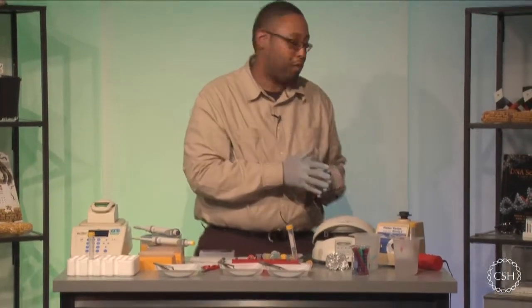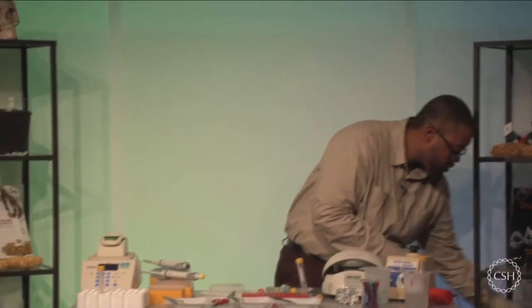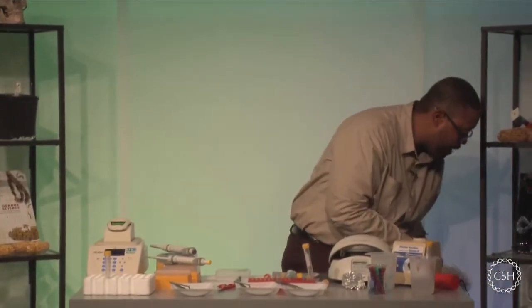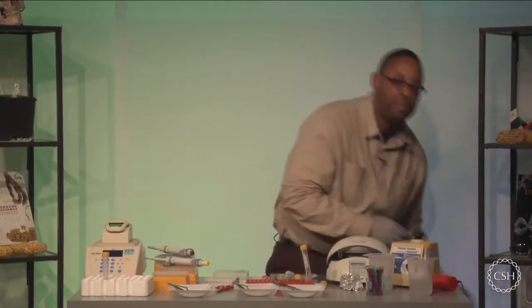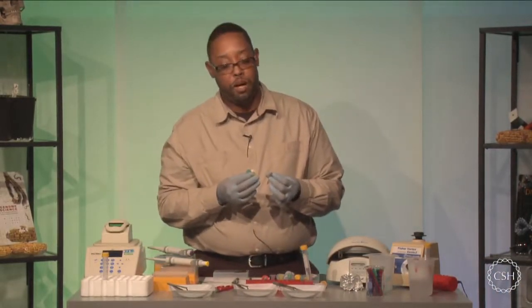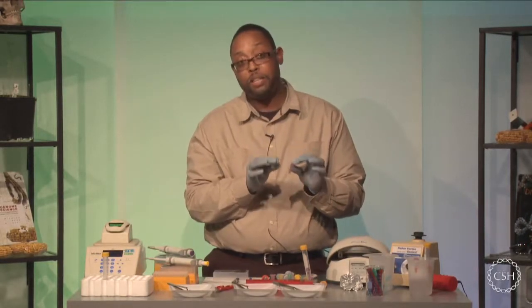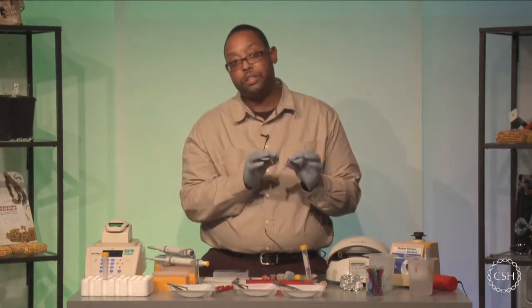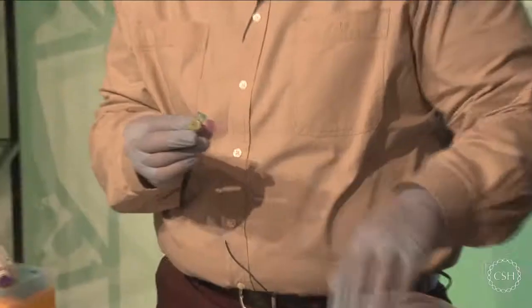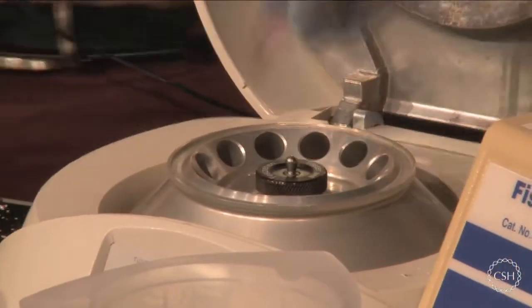Now, we're not going to wait the full 5 or 10 minutes, but we're going to shift over to doing the next part. Now, obviously, we gave time for the silica resin to bind DNA, but we're going to have to clean the silica resin as well. So we first need to remove the supernatant from the presence of the silica, and then wash the silica resin itself. So let's do the first step, which is actually to get the supernatant away from our silica resin.